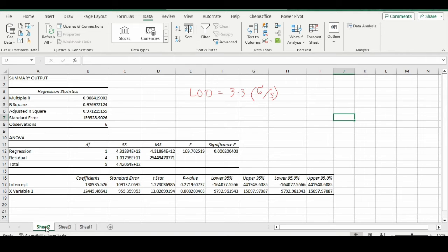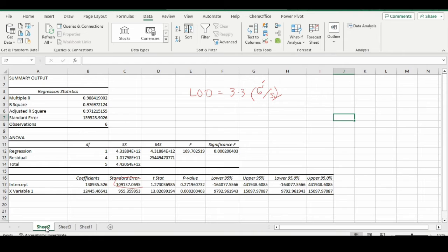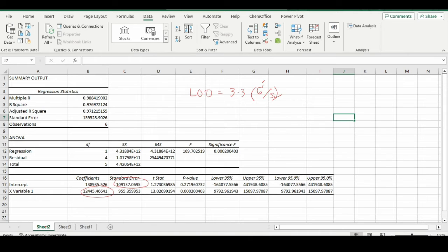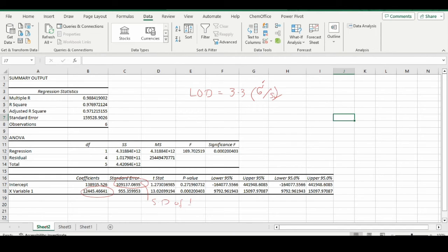So this is standard deviation, and this is slope. In the whole data, this one is our standard deviation and this is our slope. When we use these two values, this is the standard deviation of intercept, and this value is slope.